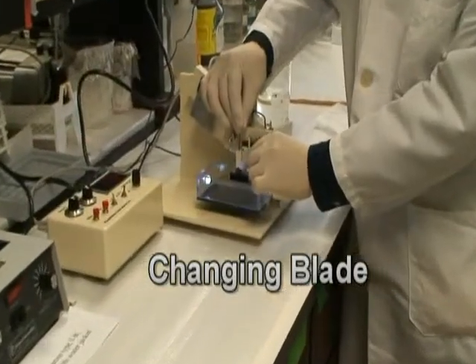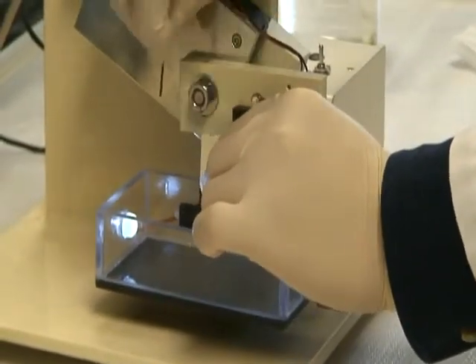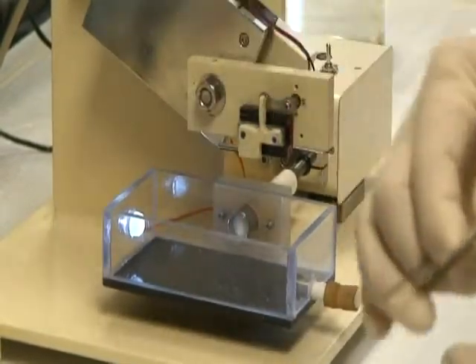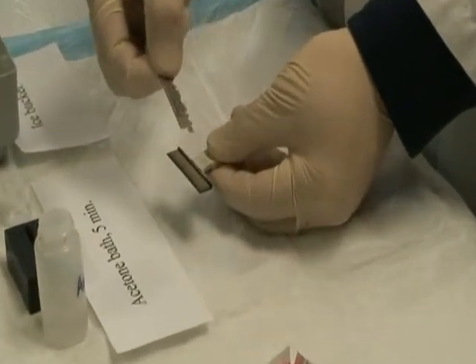Changing blade. Unscrew the blade holder. Peel off the old razor blade.